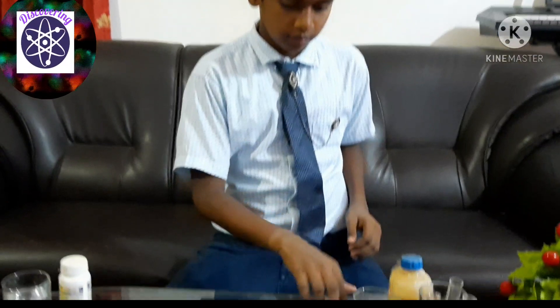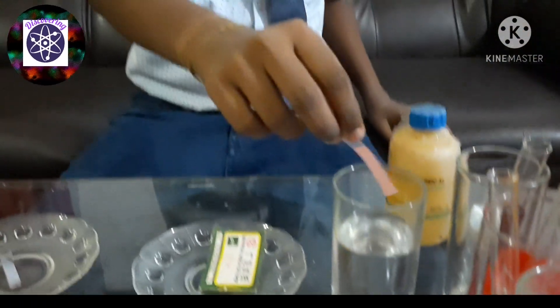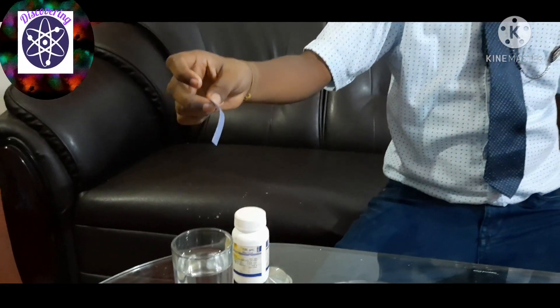Blue litmus paper — blue litmus paper is used to test acid. When acid is added to the blue litmus paper it turns into red. With the acid it turns into red. With the base there is no color change on blue litmus paper.